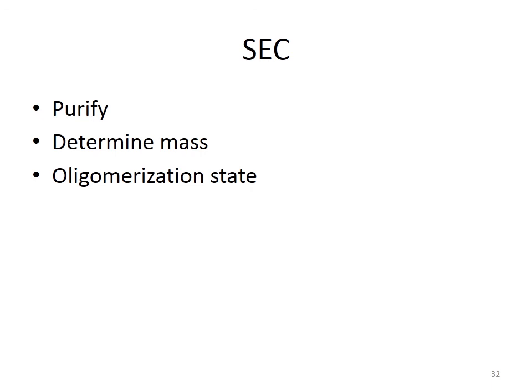So when the 4 subunits are assembled with one another, the protein has a mass of 80 kilodalton, which is the original native form of the protein. But when we add the detergent, the subunits are dissociated, and all of the subunits are of 20 kilodalton each. So we observe one peak of 20 kilodalton on the size exclusion chromatogram. In this manner, this method of chromatography could be used to determine the molecular mass and the oligomerization state of a given protein.